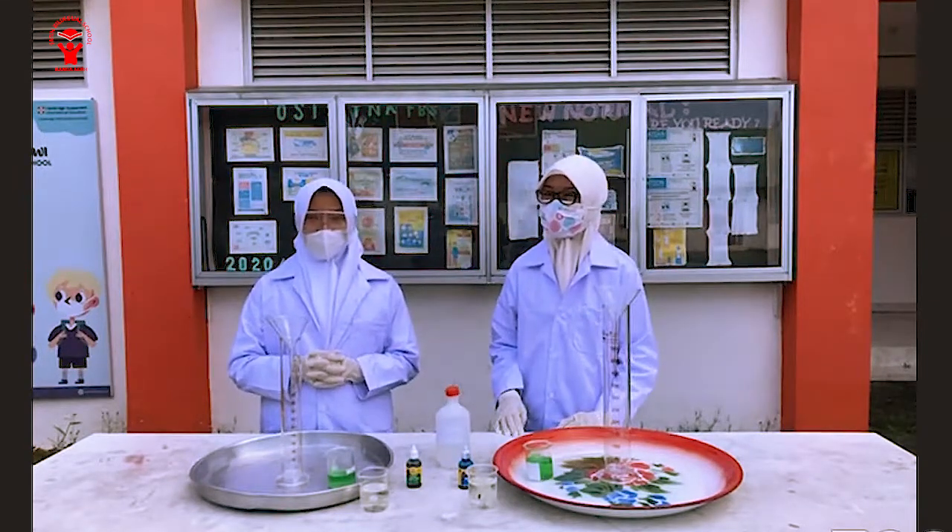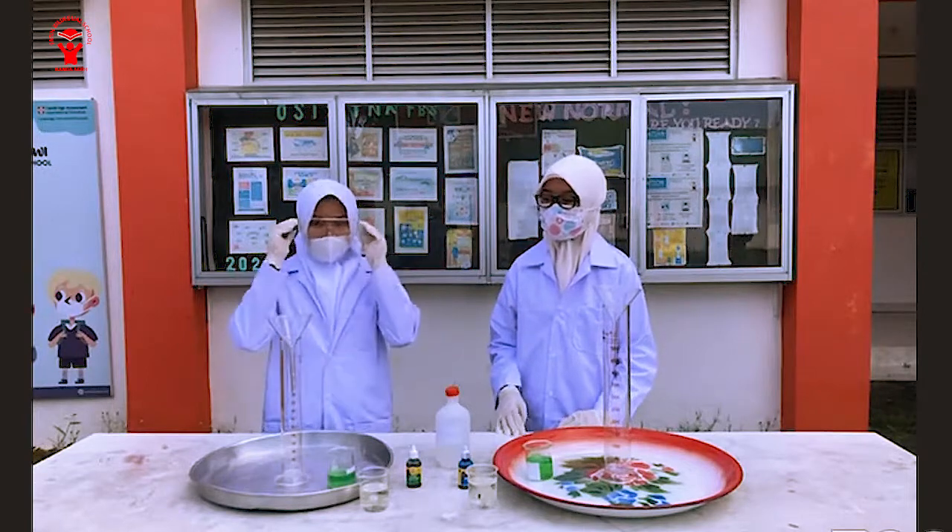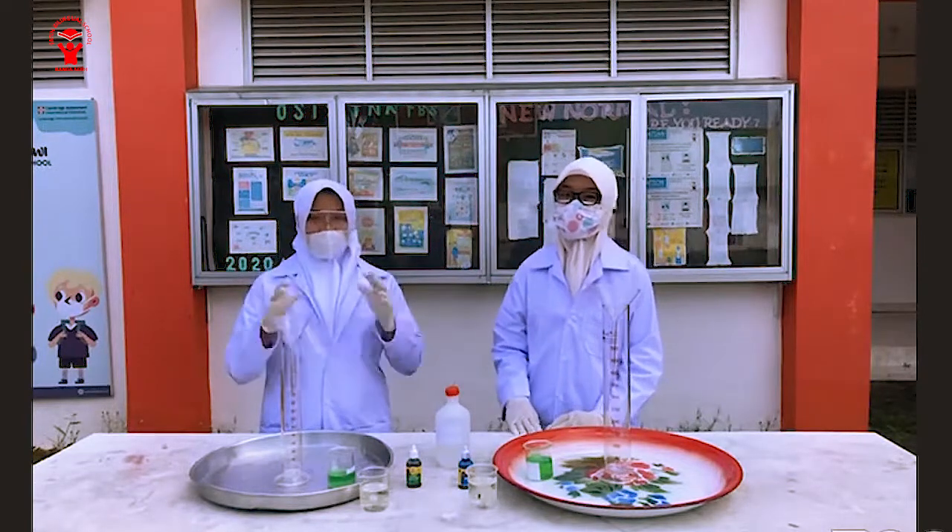So before we start our experiment, don't forget to wear your safety goggles, your apron, and also gloves.